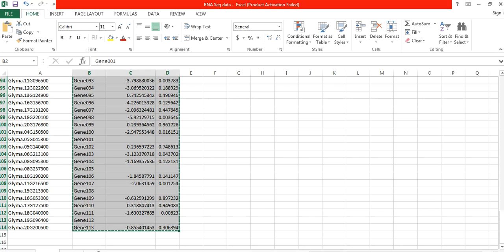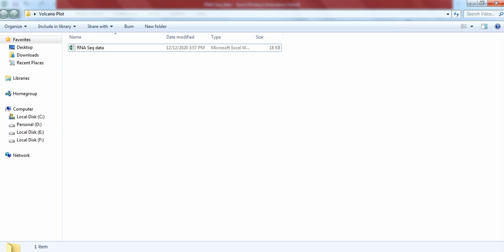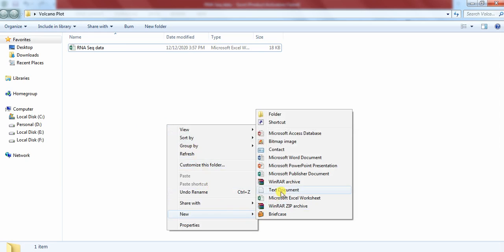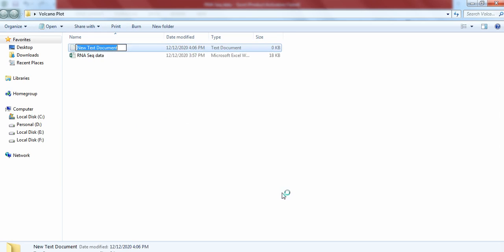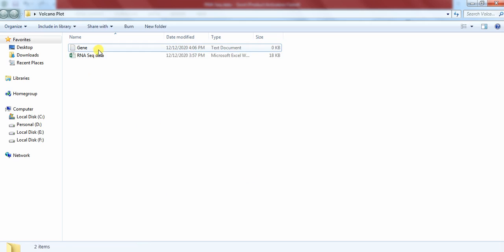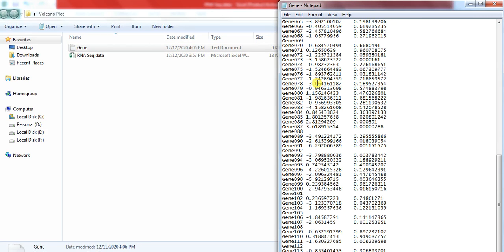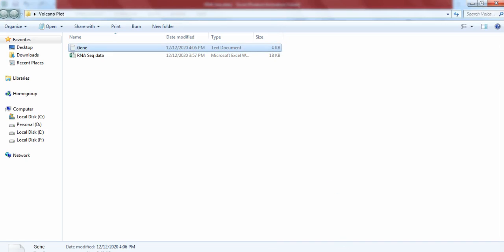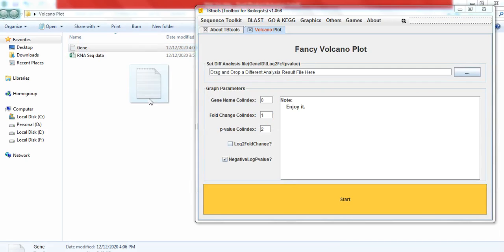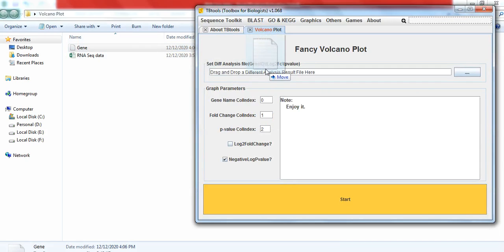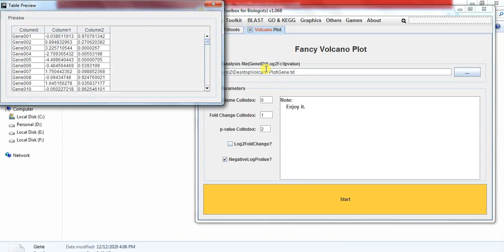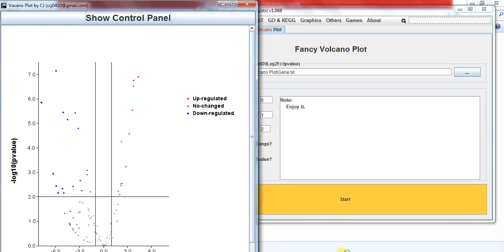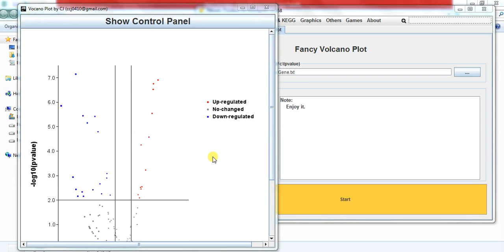Now make a text file. Open it, paste. Now open the TBTool, drag it, ok, and start. Now you have got the Volcano Plot.